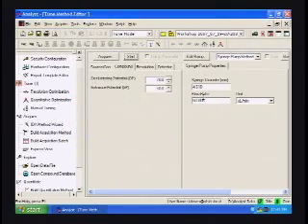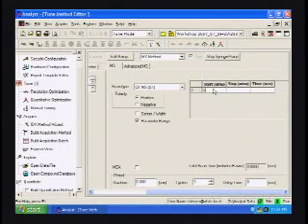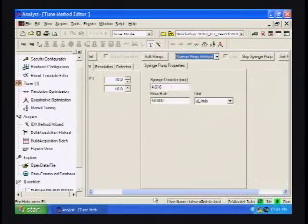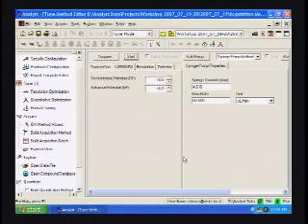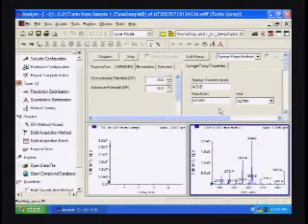Oh, that's right. Look, it's giving me all kinds of errors because I forgot to fill out my table. Which is exactly what it will do. If you don't have your table filled out and go to collect some data, it will tell you that that is impossible. Okay. Now let's start this up again, see what we get. Now I've left it in the syringe pump method screen just so that once we realize we have a nice steady injection, we can change the flow rate back down to 10.